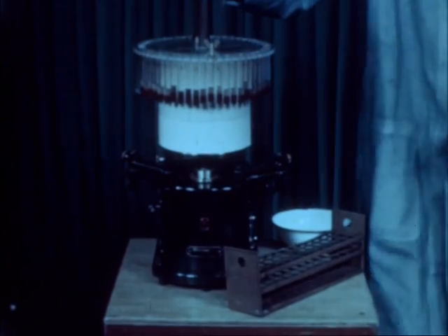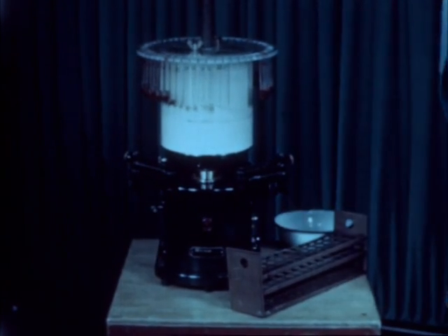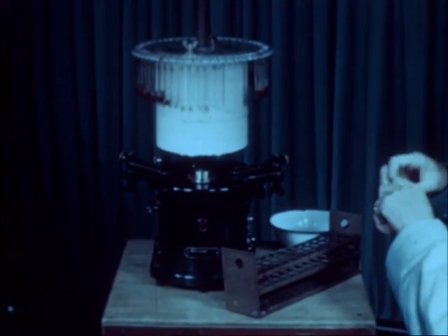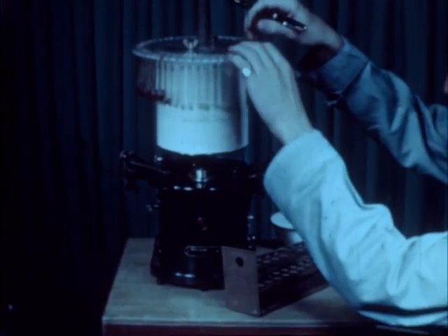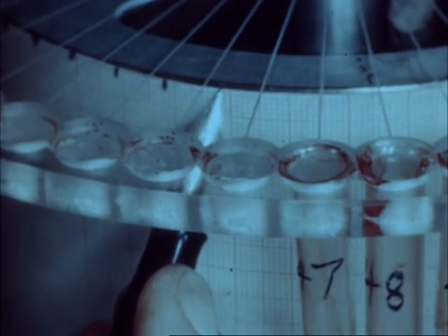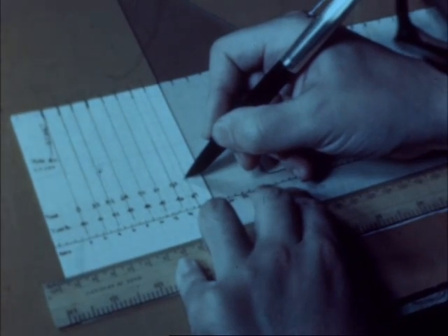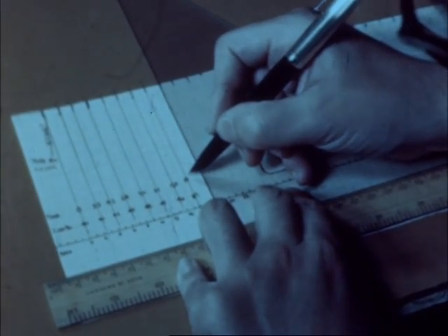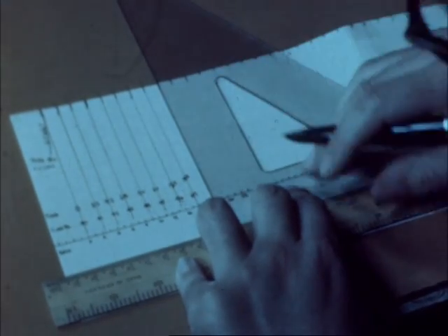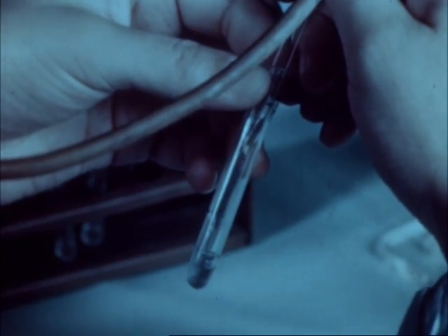Here are the centrifuged tubes. The timing of each sample is marked on graph paper wound round the drum. The graph paper taken off the drum is marked for subsequent plotting of dye concentrations against the time scale. To obtain adequate amounts for colorimetry, the dyed plasma is mixed with equal quantities of saline.